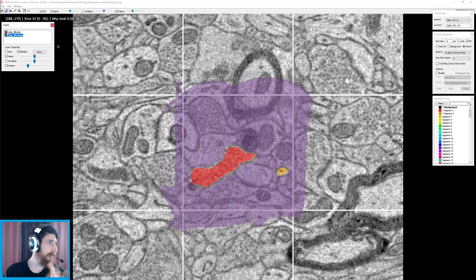Now, we're going to go to the Sparse cutout 38 folder. We're going to create a new folder in the Google Drive. We're going to call it Sparse cutout 38 export. Did I spell something wrong? I might have. It's okay. Okay, we're going to open that.